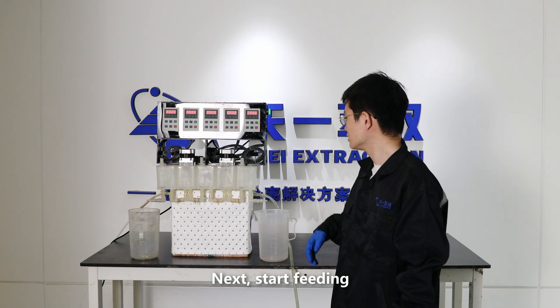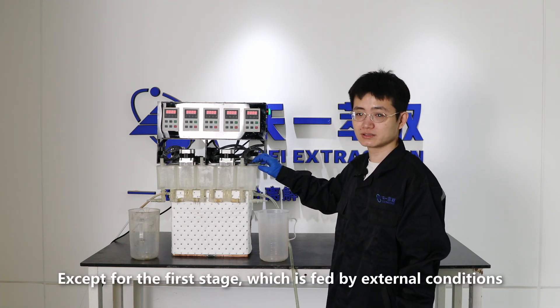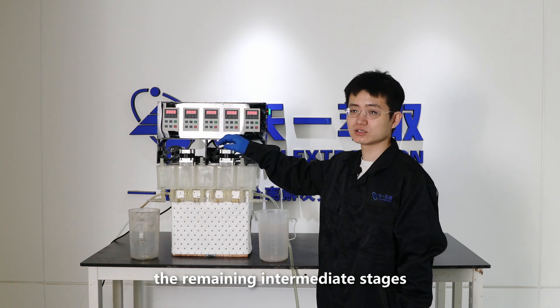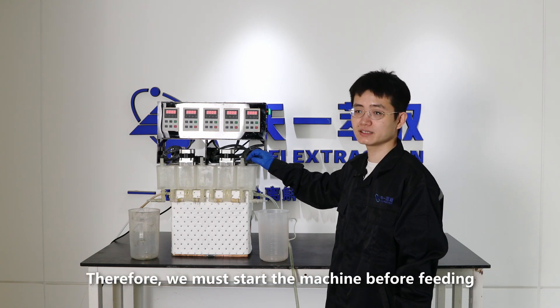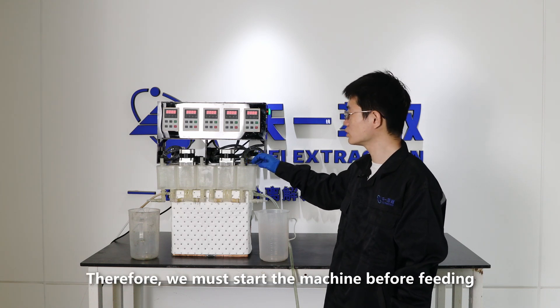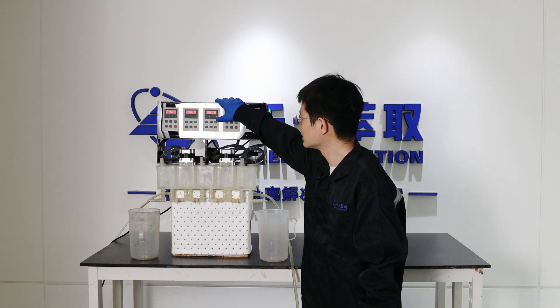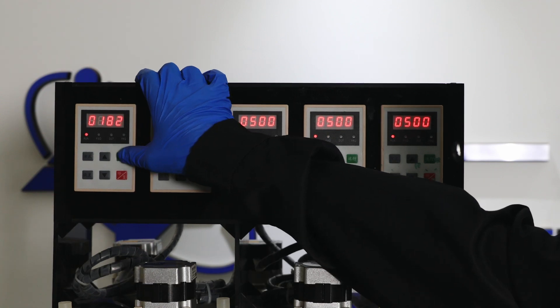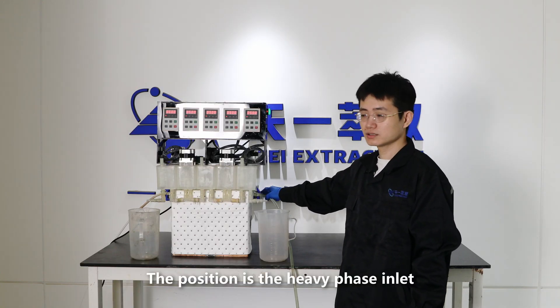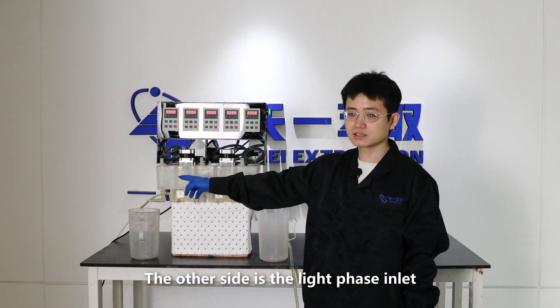Next, start feeding. Except for the first stage, which is fed by external conditions, the remaining intermediate stages are all drawn in by the suction force generated by the mixing impeller. Therefore, we must start the machine before feeding. To ensure that the feed liquid can flow smoothly to the next stage, this controller can be turned on step by step to feed the liquid. This position is the heavy phase inlet. The other side is the light phase inlet.